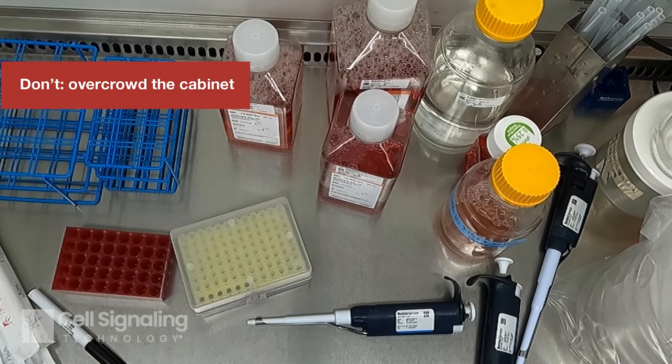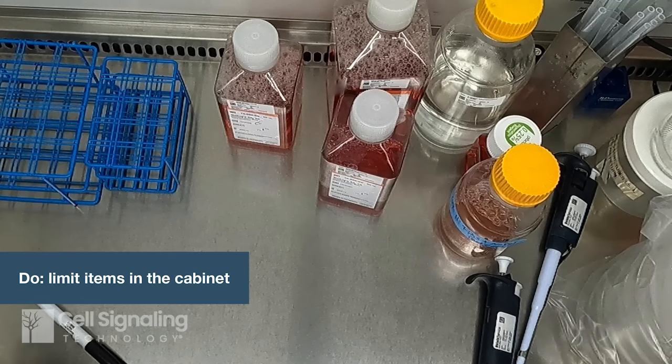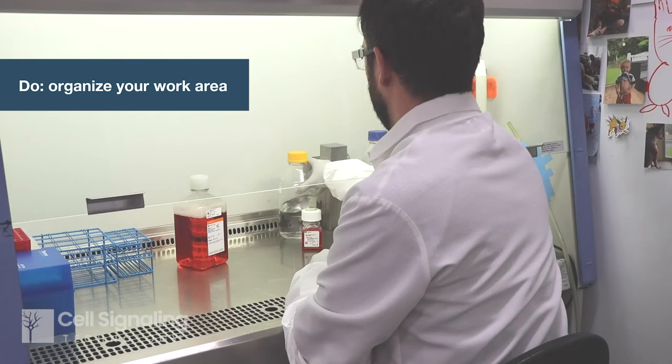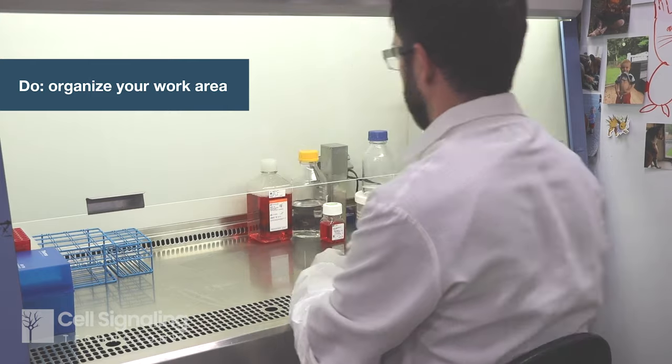Don't clutter the cabinet with too many items, as overcrowding can disturb the air curtain barrier. Plan ahead and use only what you need for each step. You can keep the pipetter and consumables to one side, depending on if you are right or left-handed. Other items can be placed towards the back of the cabinet, leaving the center as your working area.